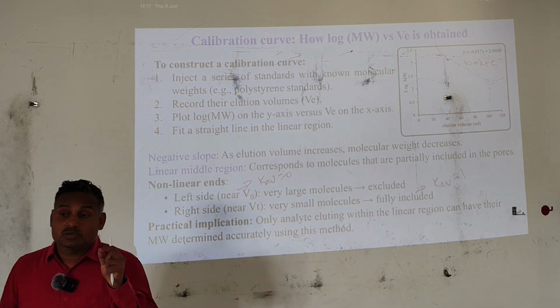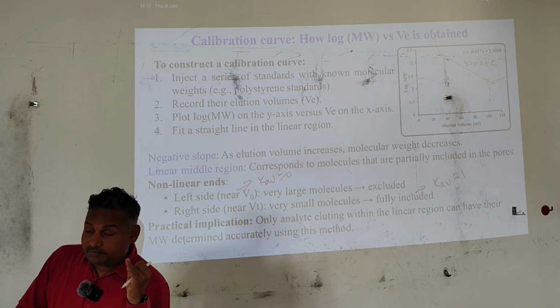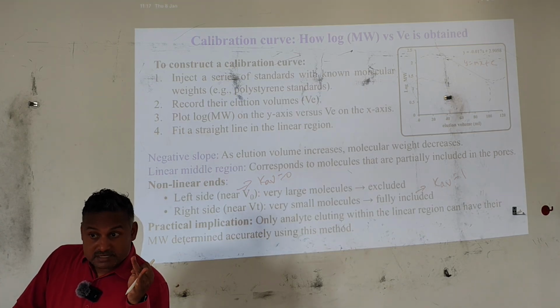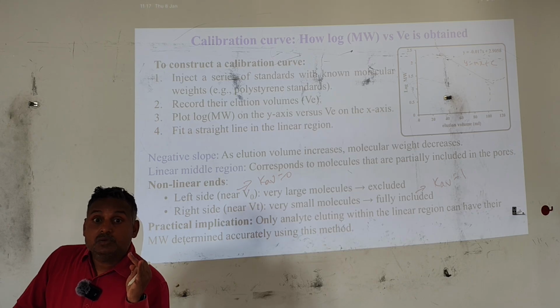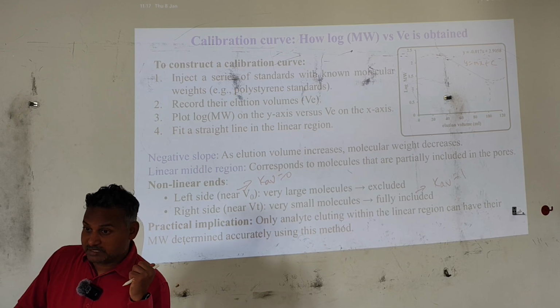That means this method is useful even to determine the molecular weights of the compounds present in a mixture. In addition to qualitative identification and quantitative analysis, this application is also useful for the determination of the molecular weights of the compounds present in the mixture.